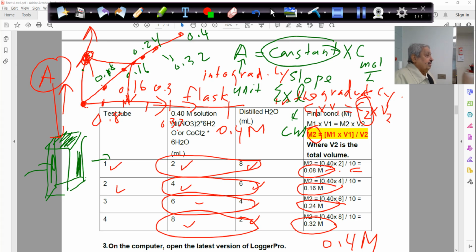Everybody's following? So we have four calibration dilutions we made with the 0, and with the start solution, 6 points. And then we'll do the unknown all the way at the end. Put it in and see what absorbance this will give you from the computer. You are not interested in the concentration. Your concentration will come from the graph itself, from Excel. Everybody is following?